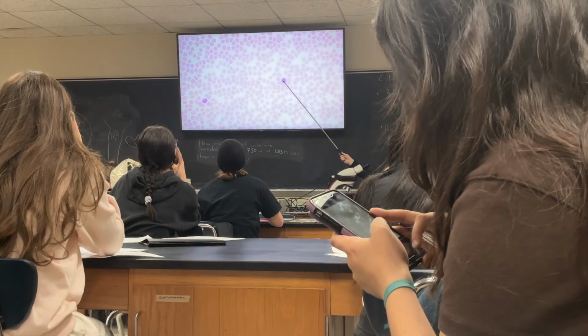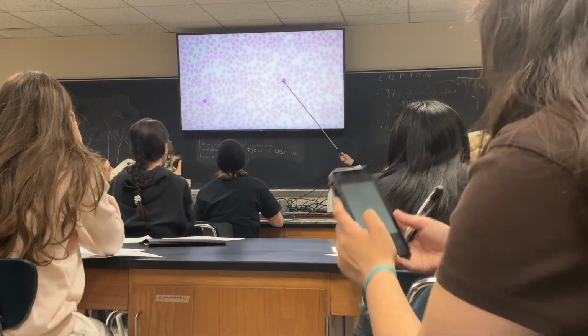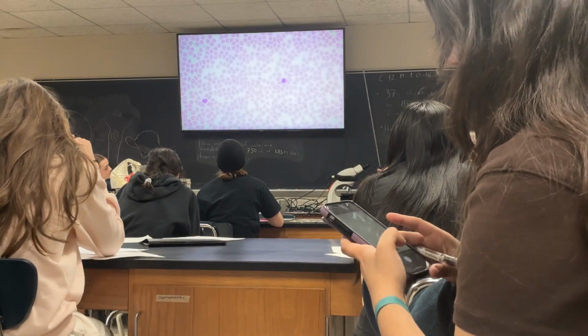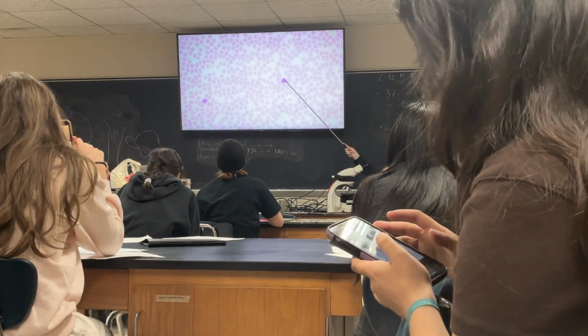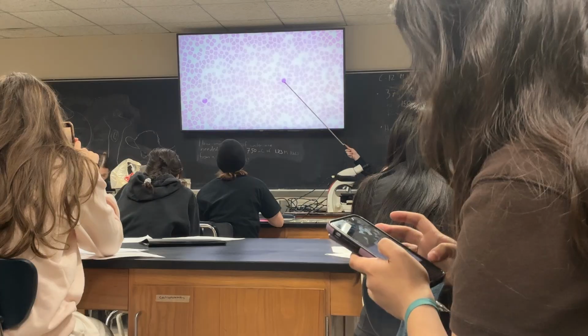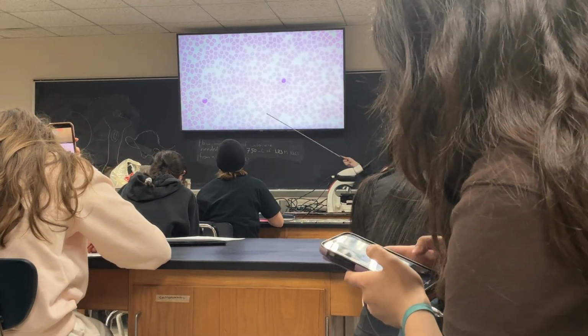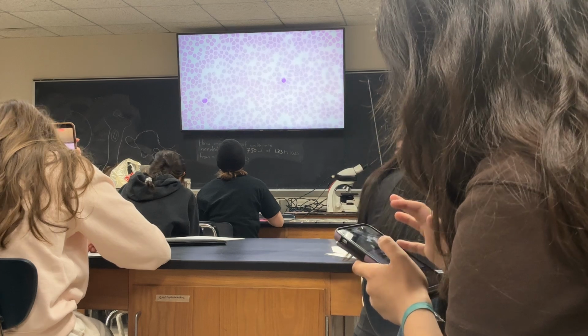ID cell. It's not red, it's white. So it's just a white blood cell. We're not going to get into the specifics, that's probably a lymphocyte. But there's a whole bunch of other white blood cells. For this practical, it's either red blood cells, white blood cells, or tissue, which is just blood. Okay? So that one shouldn't be too hard for you.